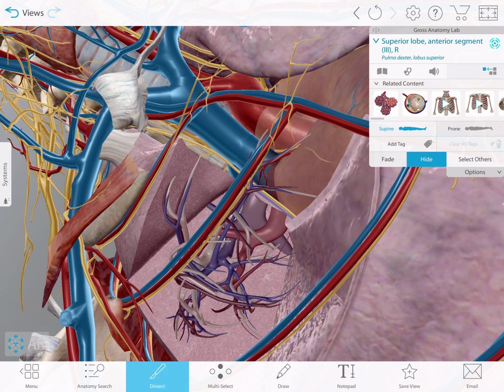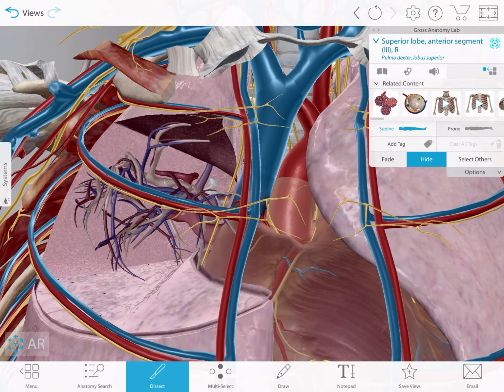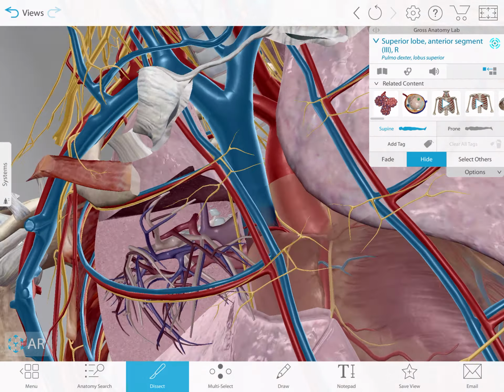That's going to bring the air from the trachea, from the outside, into the lungs itself, where we're going to fill up the alveolar sacs where the alveoli capillaries are. That's going to give you your gas exchange, where we get rid of carbon dioxide and get fresh oxygen into the body. And that kind of gives you an overview between where the lungs are.